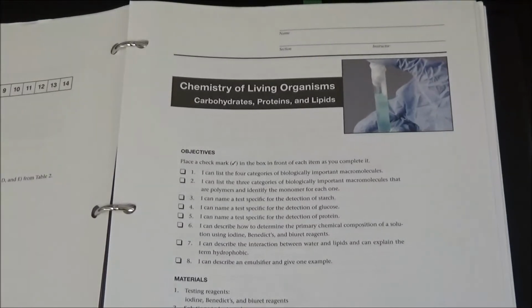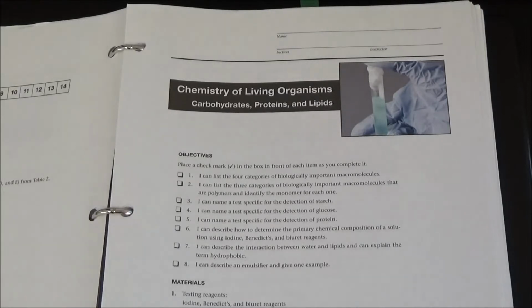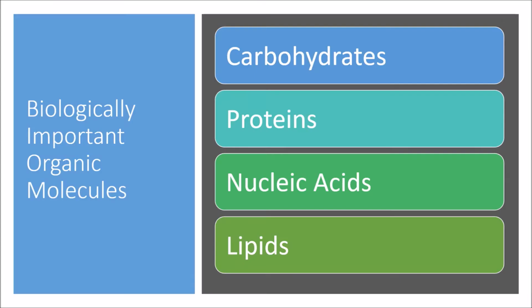Today's laboratory activity is Chemistry of Living Organisms: Carbohydrates, Proteins, and Lipids, which begins on page 37 of your lab manual. Please take a look at the objectives that are listed for this activity.